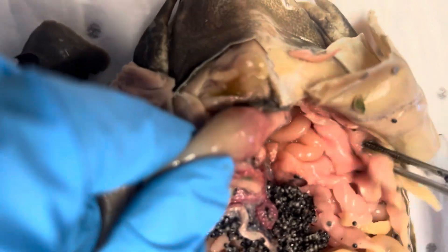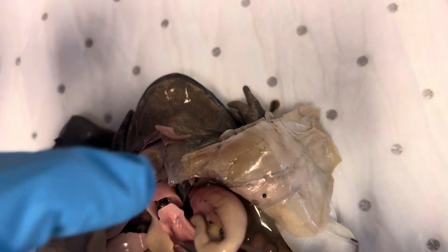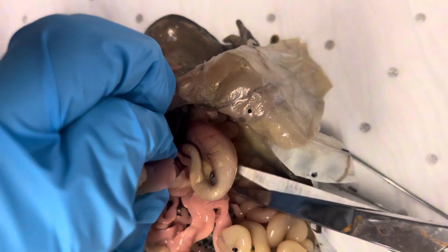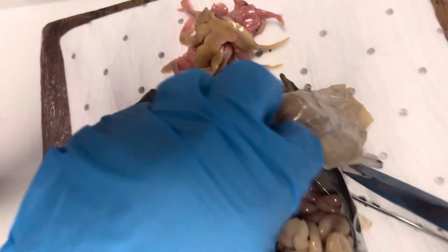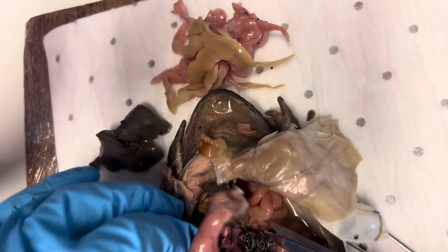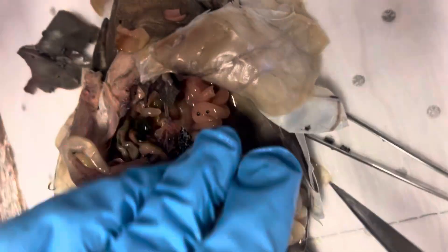You can determine what it's been eating. And then these here are called fat bodies — this keeps the frog going in the leaner times. Get as far up as possible to take the stomach out, and you'll see you can track all the way down to the small and large intestine. Again, there's more of the intestine up here, so a lot of it's been pushed out of the way because of the eggs.